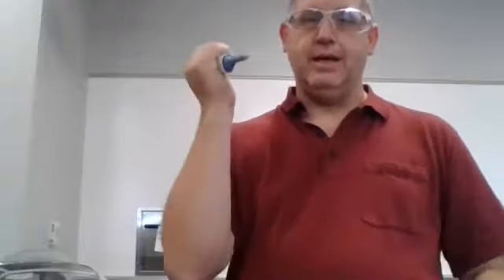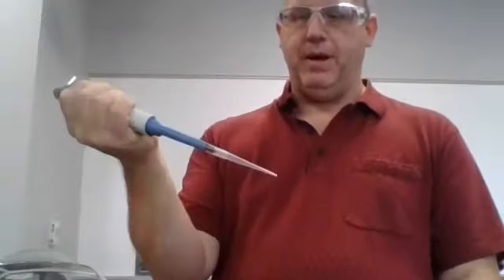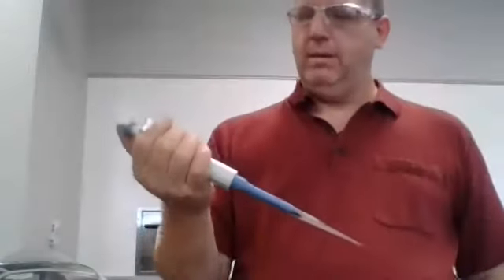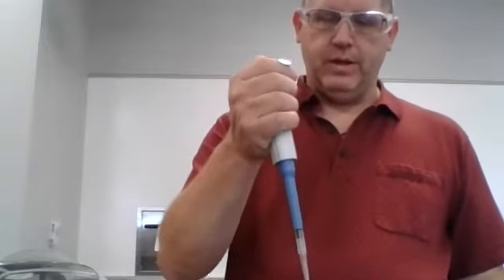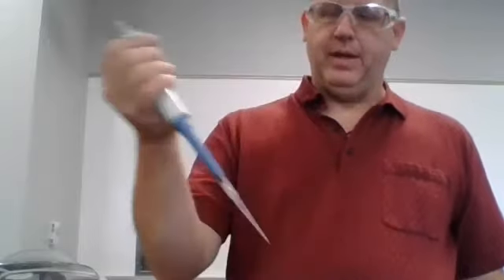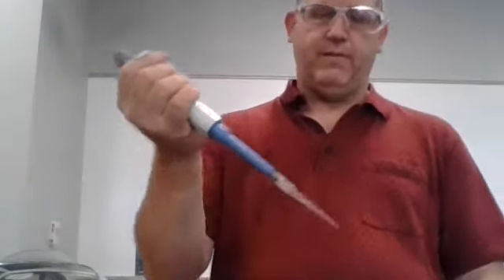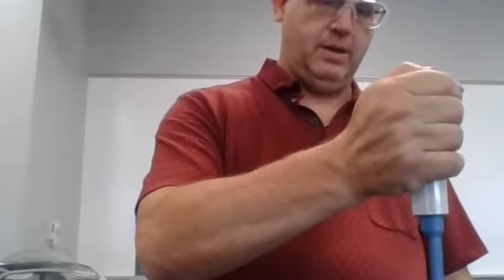Now, normally I wouldn't just be sticking things into an iron standard, but this is a sterile and clean pipette tip, and I have it set to bring out 1 milliliter, also known as 1,000 microliters. I am going to take that. And here I have my volume, not very well. I'm going to try that again, and actually get it into the liquid this time. And there we have our 1 milliliter, which I have then entered into my solution.